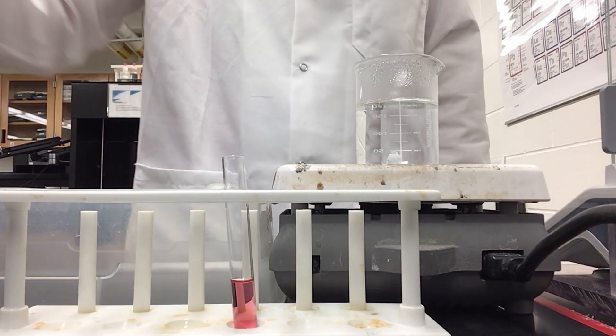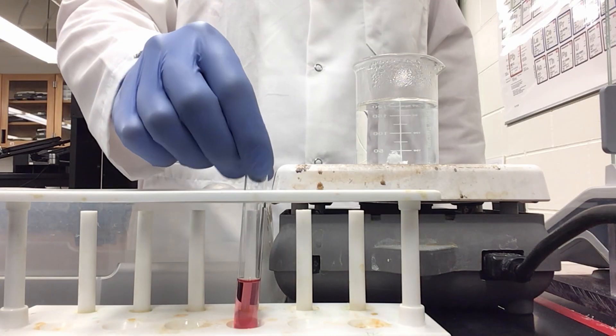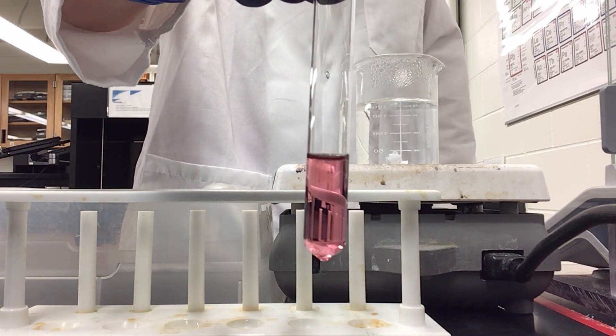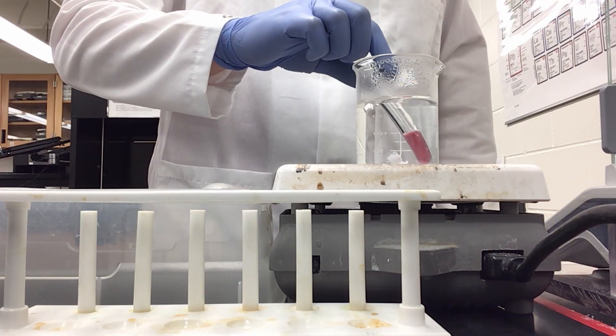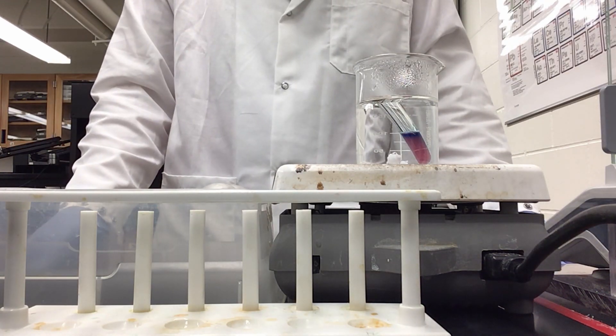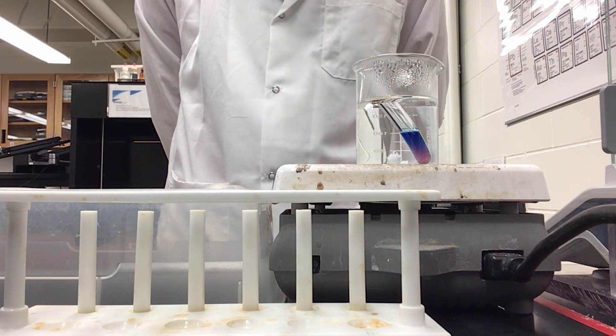Here I have a tube containing hexa-aqua cobalt cation. You can see it has a very nice bright pink color. I'm going to add it to my hot water bath, which is at about 85 degrees Celsius. And as you see, we will start to see a color change — it is starting to go blue.